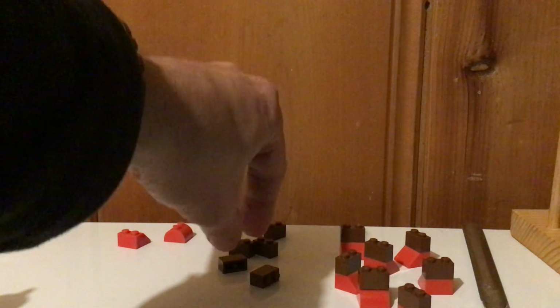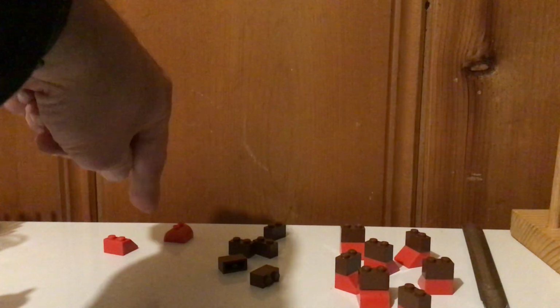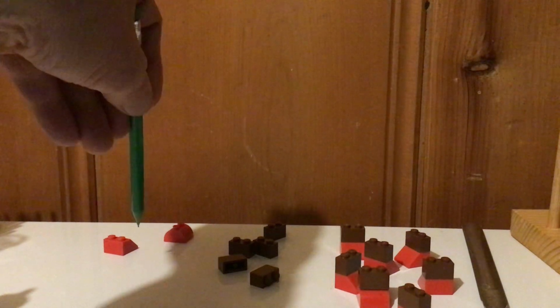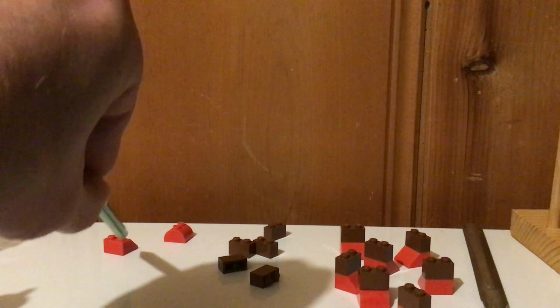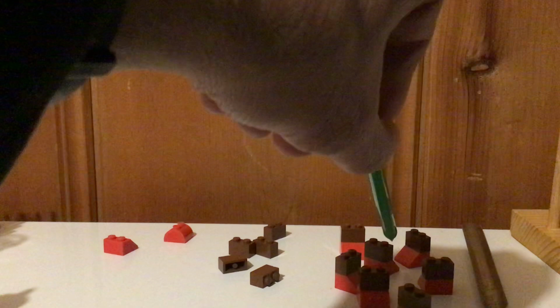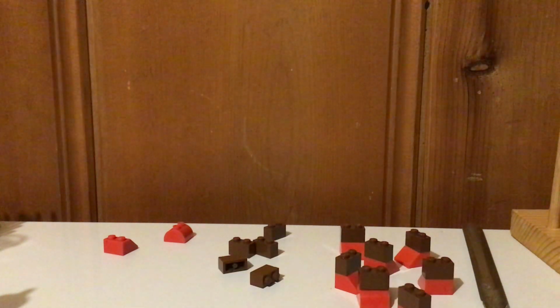Now what's going to happen is I'm going to keep going, and these might combine, but then you're going to start to get the reverse reaction. So it's going to even out. Reactants going to products, and products going to reactants at the same rate. Okay, so I'm going Fe plus 3 and SCN minus going to this, and FeSCN plus 2 going back to SCN minus and Fe plus 3 right there.